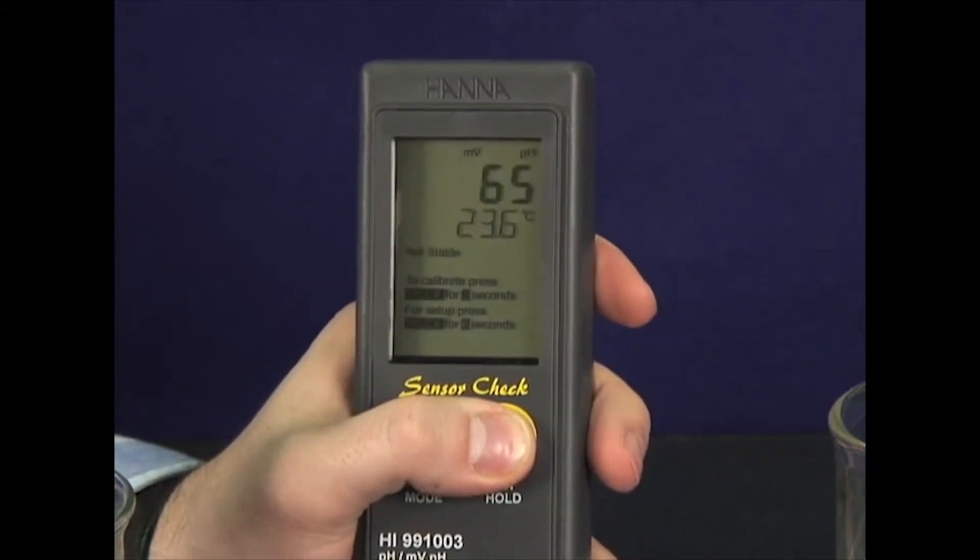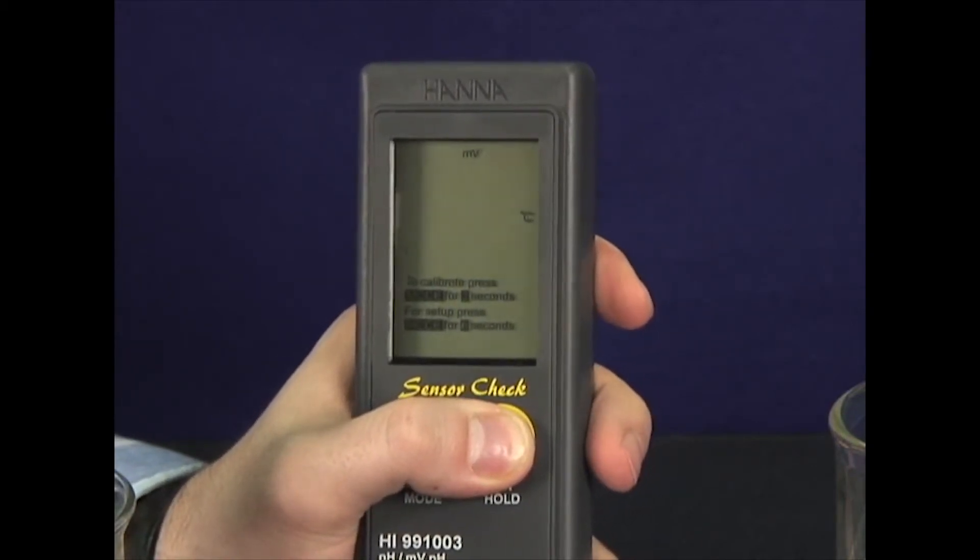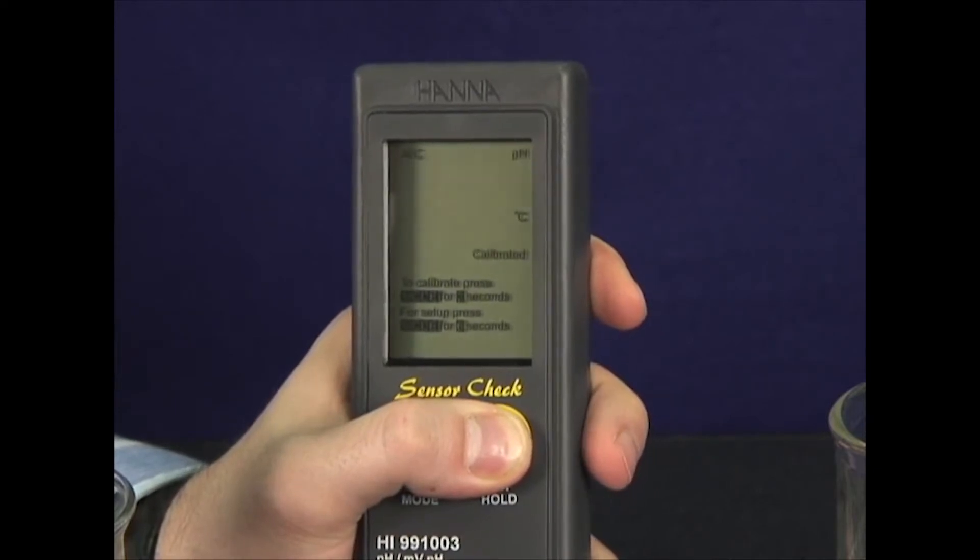Just press the set hold button to switch parameters. No changing electrodes. This meter does it all.